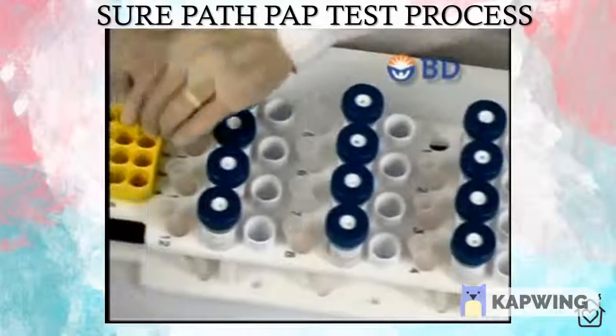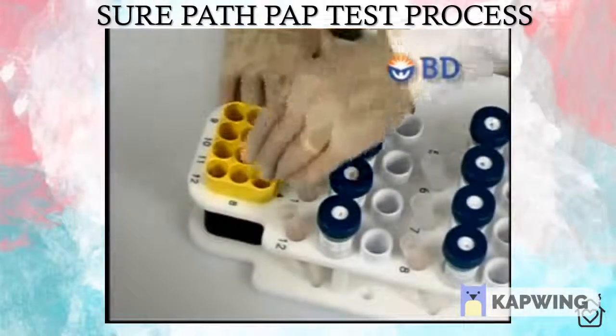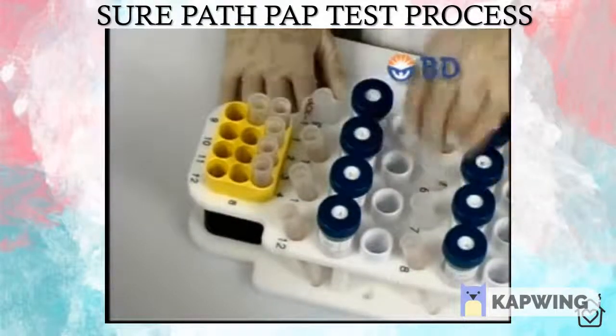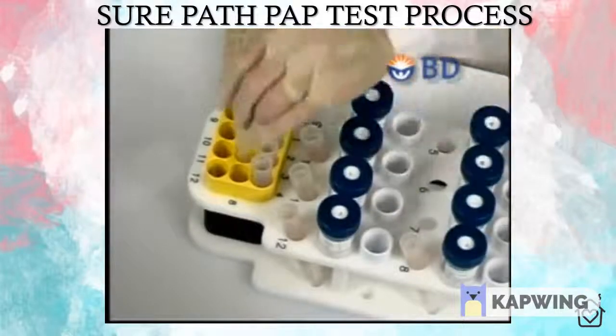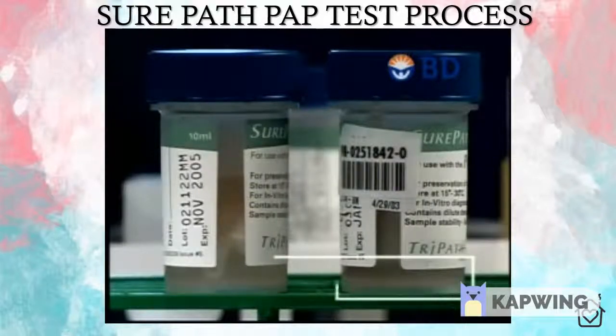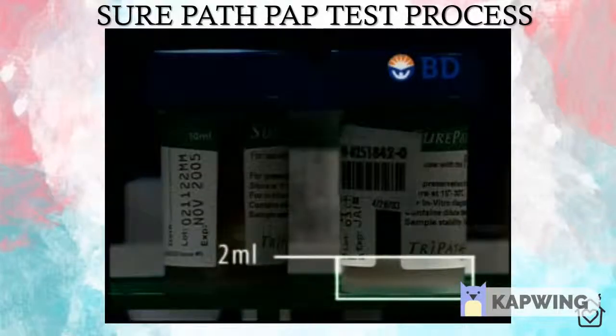Once started, a disposable PrepMate syringe is loaded and pierces the cap of the SurePath sample vial, mixing the solution to randomize the cellular contents. Eight milliliters of sample solution are then withdrawn from each vial and layered onto the density reagent within the corresponding centrifuge tube. This process automatically repeats for each loaded sample and takes approximately three minutes per tray of up to twelve vials. The two milliliters of remaining sample within the SurePath collection vial can be immediately stored or redirected for additional testing.